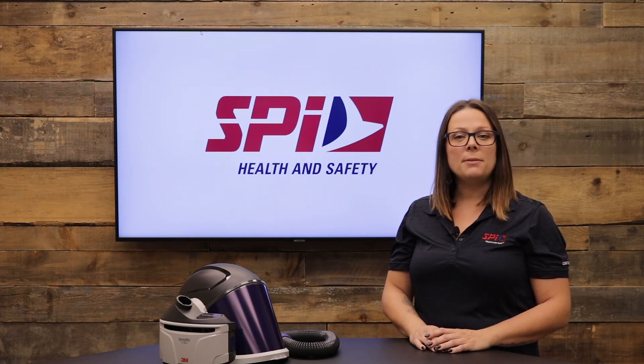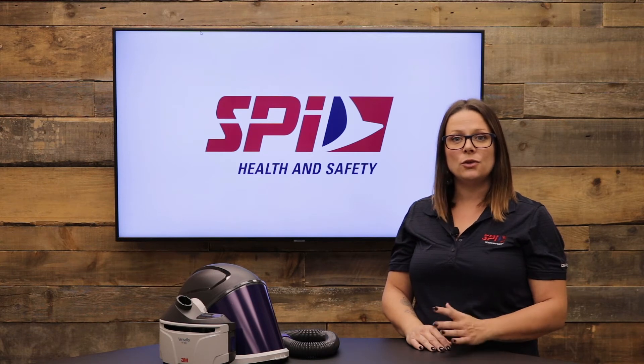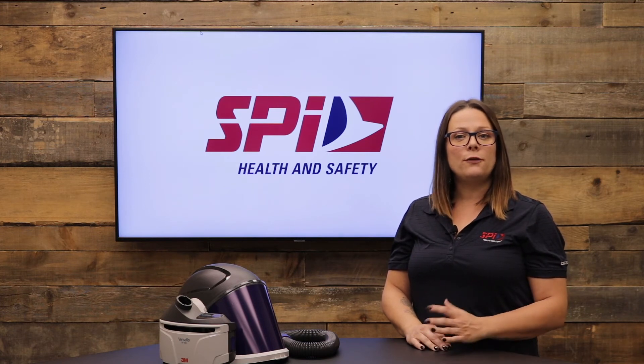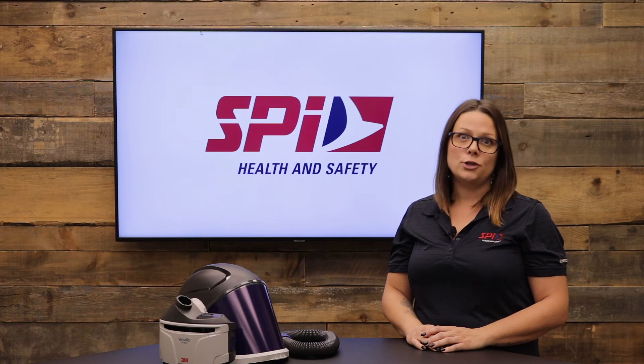The 3M Versaflow PAPR TR300 Plus system is user-friendly and offers an intuitive interface which allows you to monitor the operating status of your filter, battery and airflow at a glance. It comes with an audio and visual alarm for filter load and low battery, and with interactive and colourful touch points.